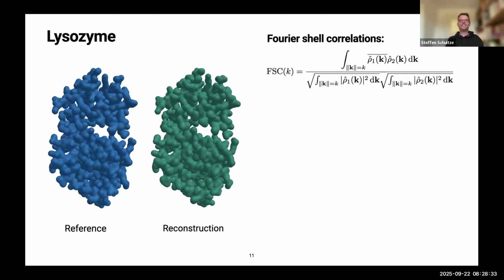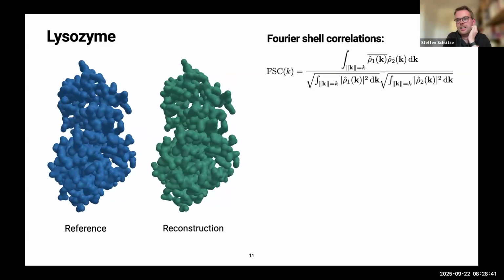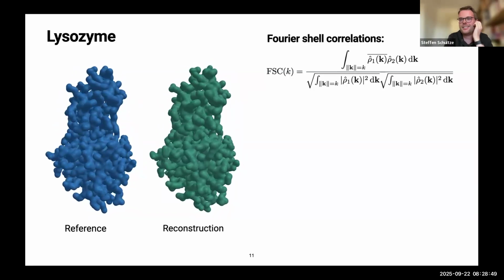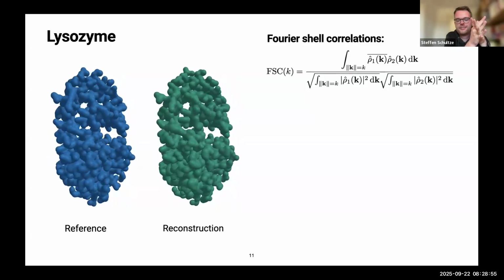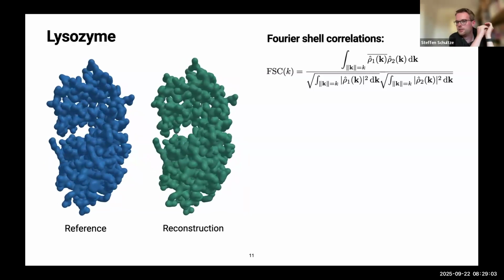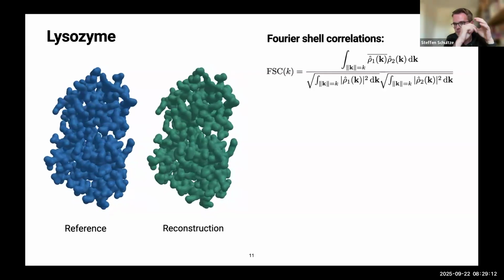I mean, I wish it was that easy. So experimental setup, of course, one needs the protein in some kind of purified form in solution. I have never actually done any of these experiments myself, I have to admit, so I'm really not the right guy to ask there. But supposing one has this purified thing, then there's injection methods, so electrospray, which uses a relatively strong electric field to relatively violently throw the stuff into the beamline in the hope that it evaporates into very fine droplets.